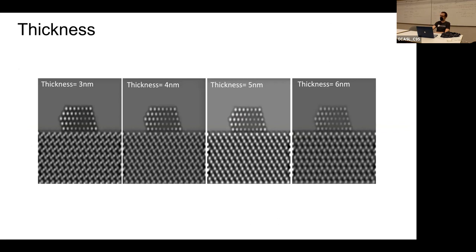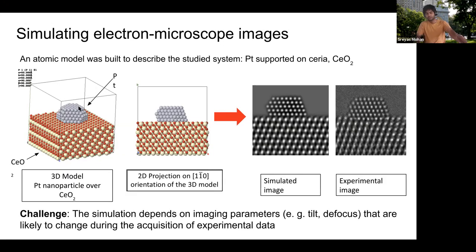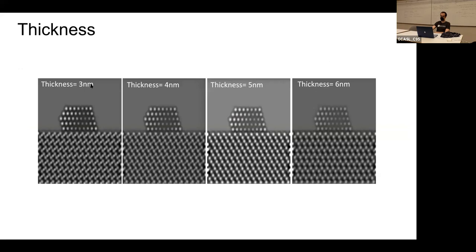Shreyas, do you remember what thickness actually means physically? It's basically the amount of... So if you go back to that support, it's basically how much is over there. How many atoms are here, right? Yeah, the thickness of the support. Actually here, you can see the dimension is 3 nanometers, so 10 to the minus 9 meter. Right, so that's how thick the material is that we're imaging.